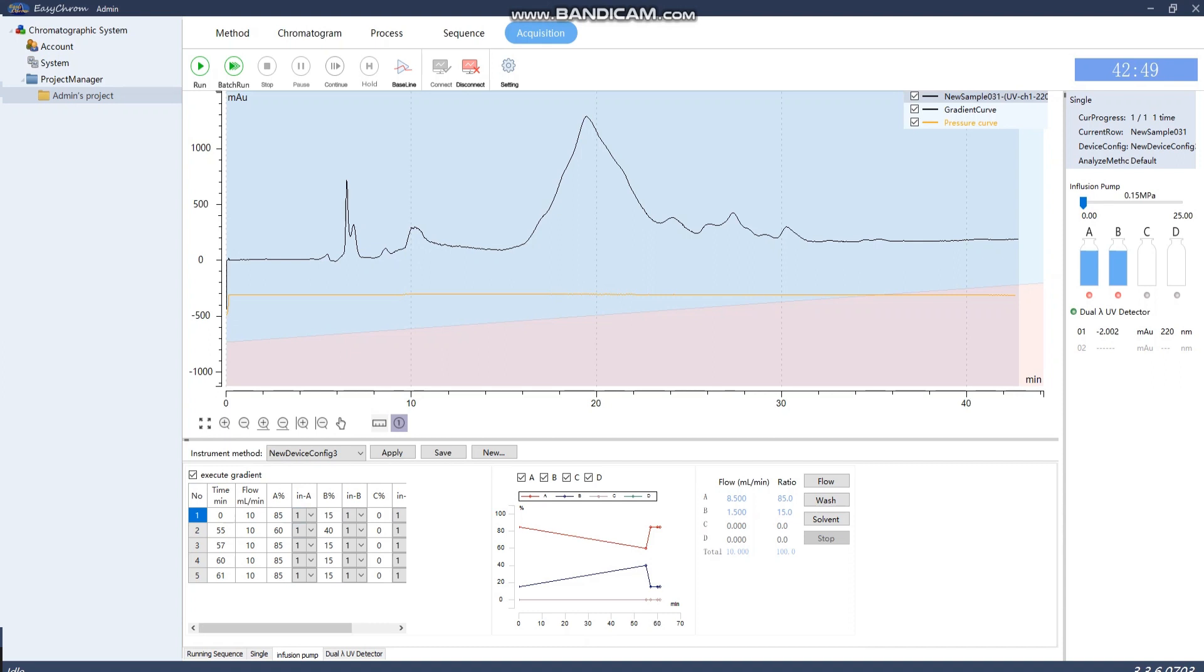This shows your pumps and detector with two channels. You can see the black line is one channel, and the red line is the other channel.